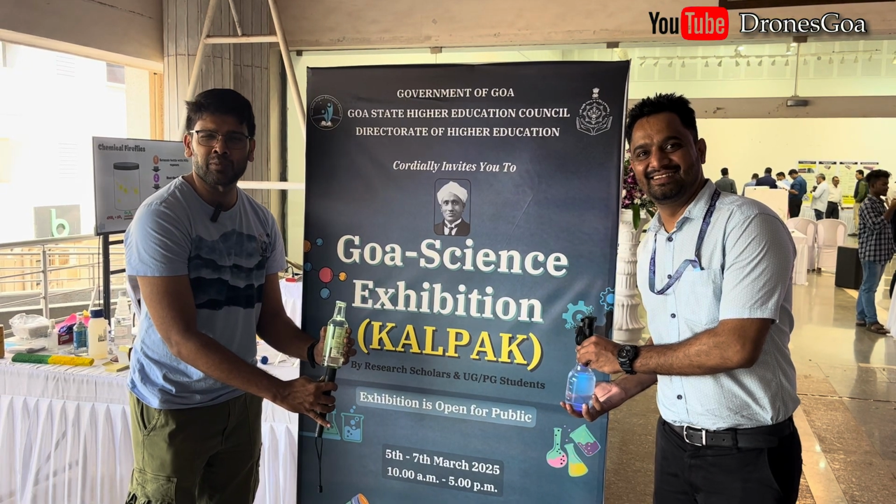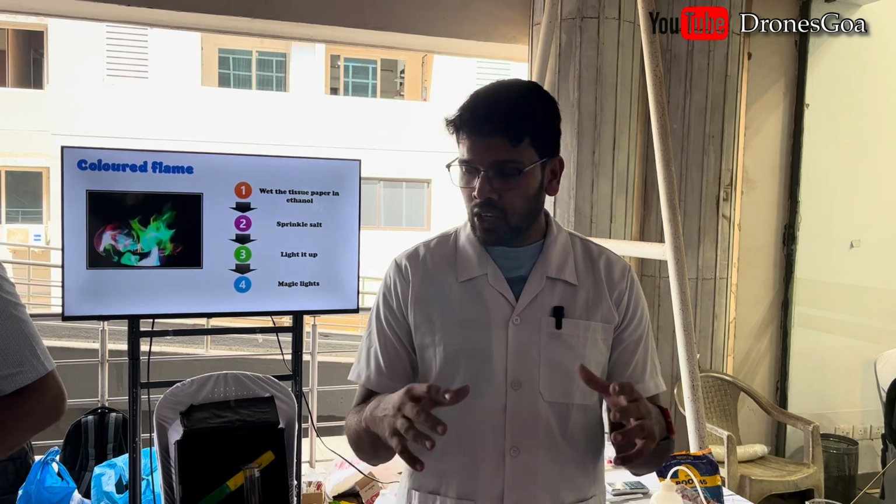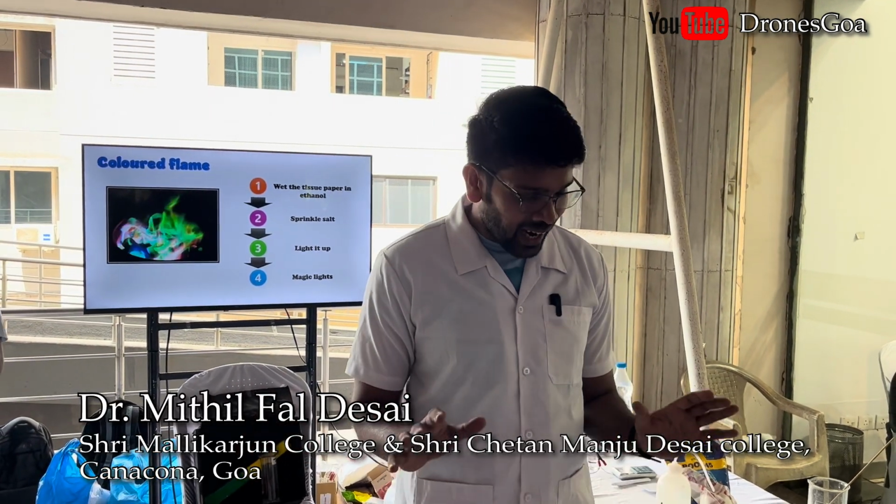Welcome to Chemistry Exhibit at Kalpak 2025. There are a lot of experiments which will help you to explain a lot of chemistry concepts. So let's start with flames.